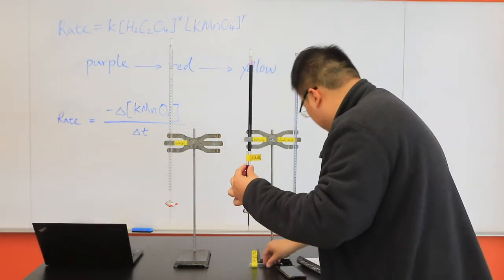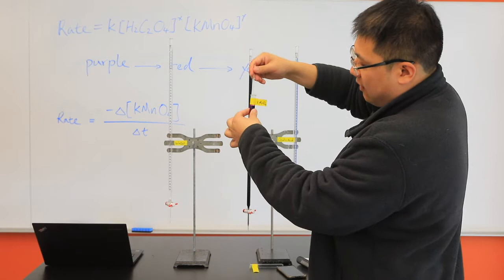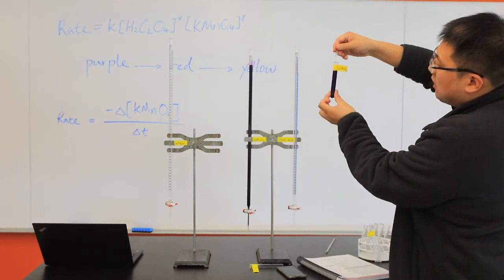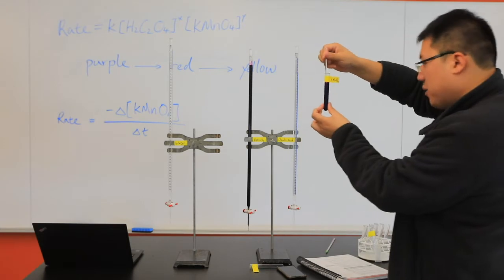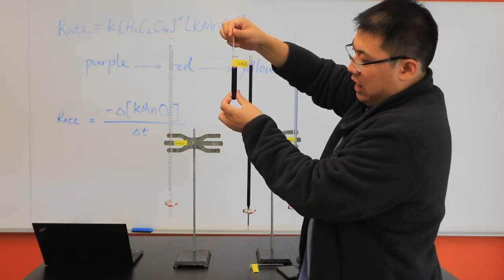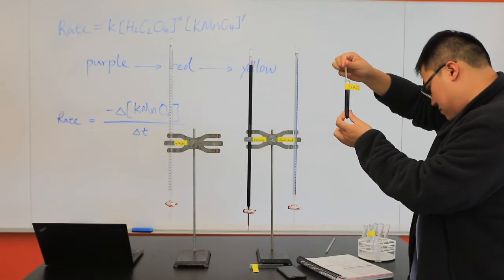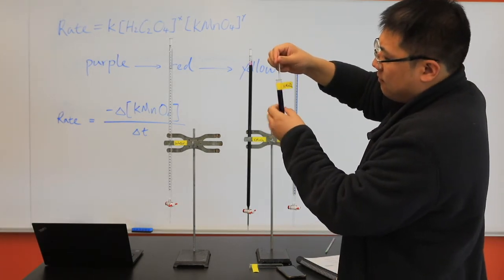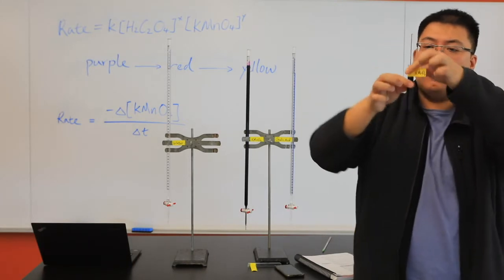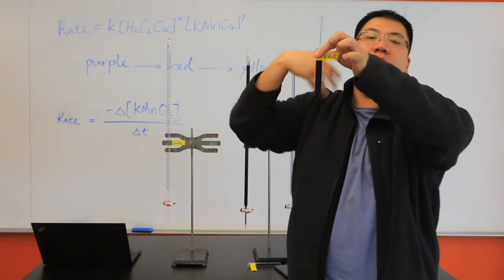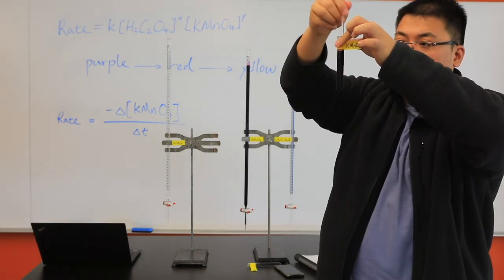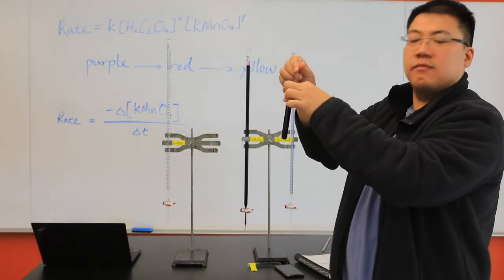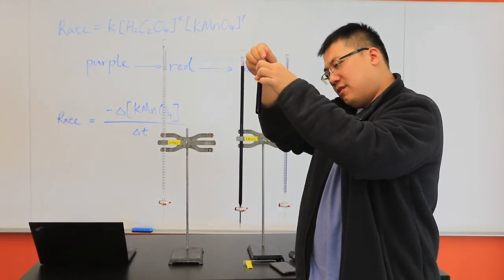Alright. Hit on the timer. Start mixing. Right now, it's still purple. We'll give some time for the reaction to turn color. I really should hold it right here so that you can see a little bit better because I don't want my body temperature to have any impact on the temperature of the solution.